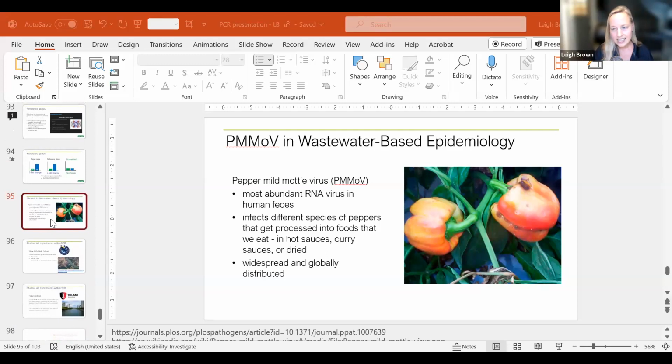What she found at the end of her experiment, the first time she ran this, it looked like there was some correlation between those FOXO3 genes and the collagen genes. However, when she ran it with the reference gene, she could see that those effects just kind of went away. Not what she may have wanted to happen. That's a little bit of a disappointment, I'm sure, but a good learning experience for her as well.